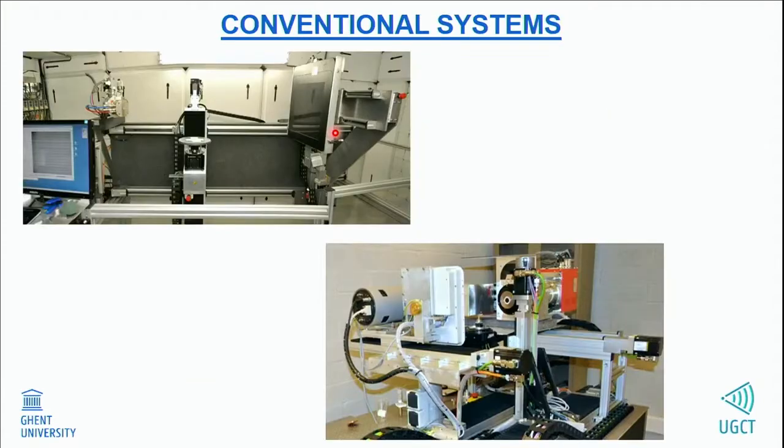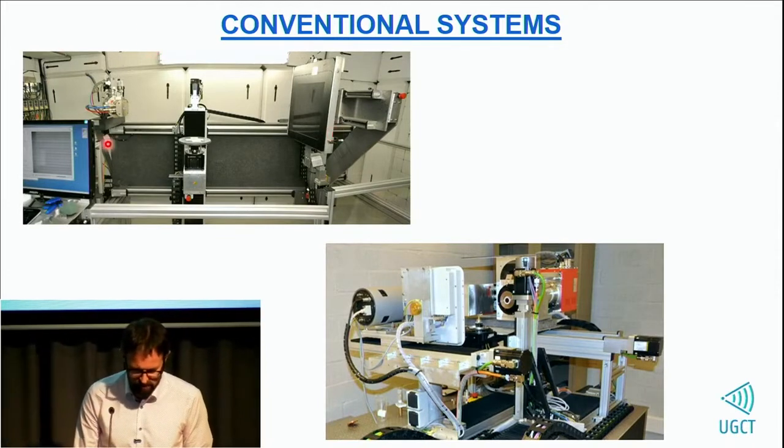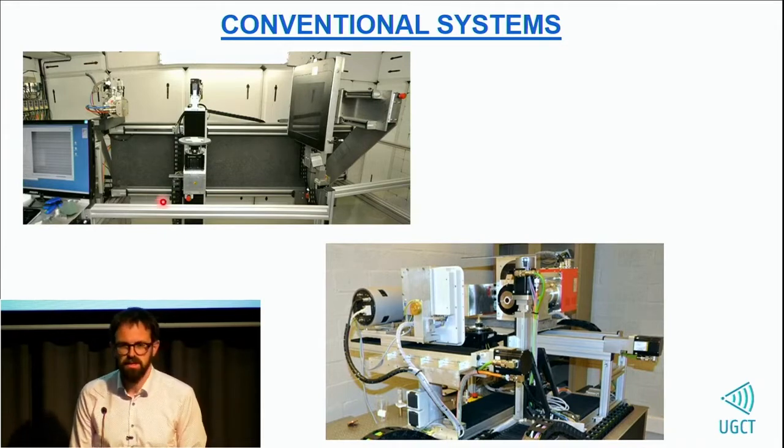for which we use what we call our more conventional systems. So that's the high energy CT scanner. It's this one. It's really quite a big system. We can move the detector almost 2 meters away from the source. So that's quite practical for very large objects. Also, the object stage can carry up to 100 kilograms of objects. So in principle, it could even carry me. Not that I want a CT scan of myself in those systems, because I'm afraid the dose would be slightly higher than on a transatlantic flight. But it's a very flexible system.